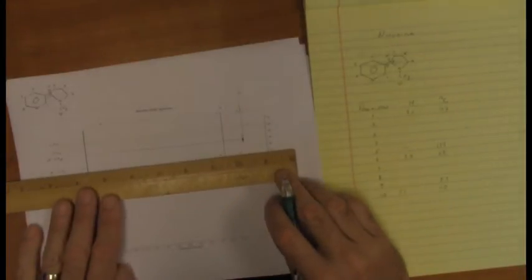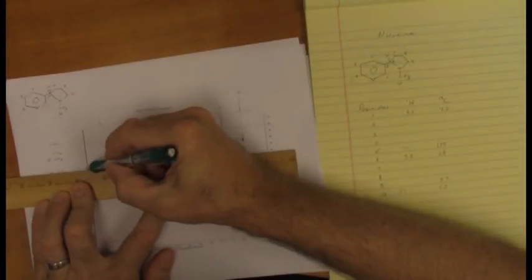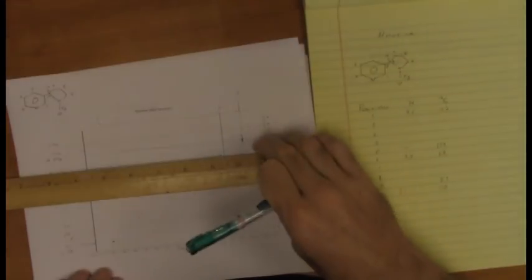If this thing's chiral, the CH2s nearby are guaranteed not to have their 2 protons with the same chemical shift. They might be really close to each other, they might have the same chemical shift by coincidence, but with no symmetry in the molecule, they cannot have the same chemical shift. So I'm going to go ahead and mark them, and this also provides a nice explanation for why so many of our protons do not integrate to 2 with these CH2 groups in them. There's a lot of things integrating to 1.